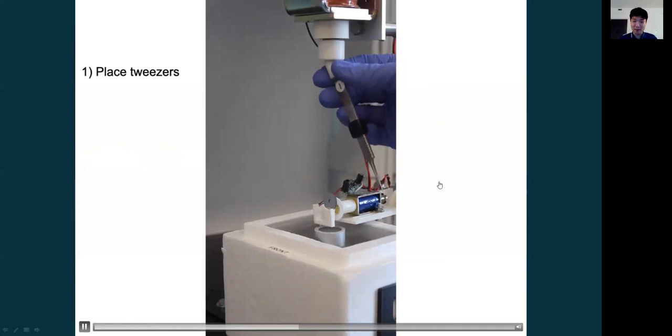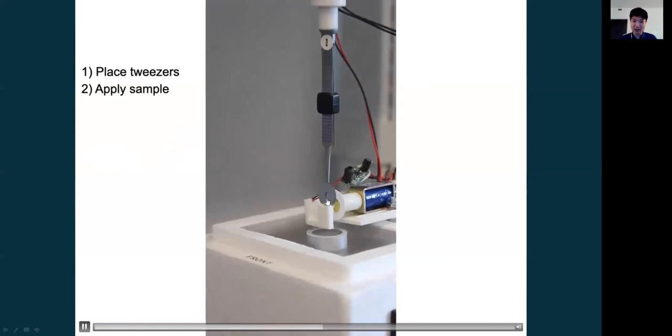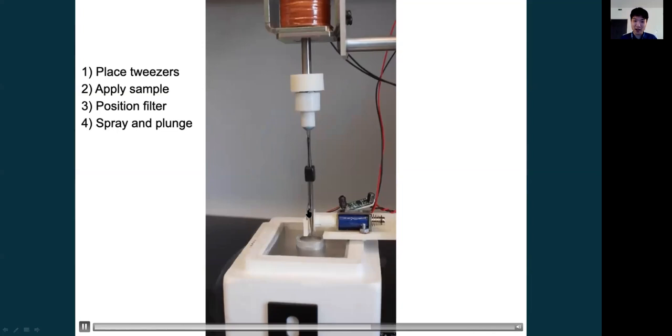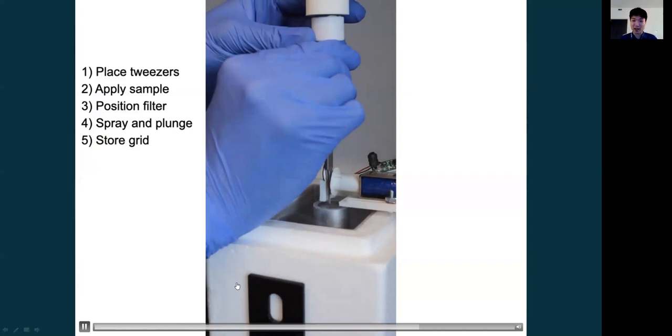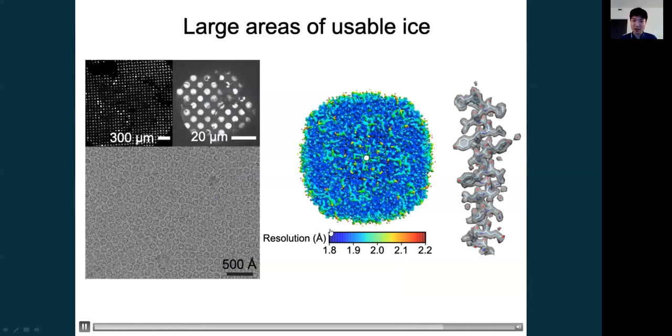And to actually use the device, what we do is we place the tweezers over here, the filter paper is behind it, the piezo with the sample will be in front of it, and your liquid is applied to the back of the piezo. Your filter paper is now pushed against the grid, and then after sample application, the grid can be plunged straight into the liquid ethane with a short distance to allow for high-speed time-resolved experiments if required. And then afterwards, you can store your grid in your grid box or image it in a microscope.